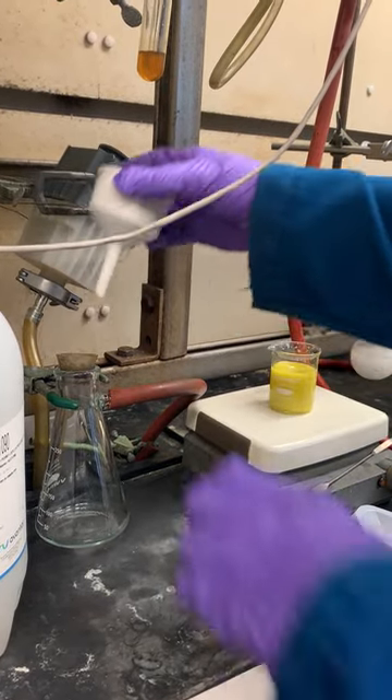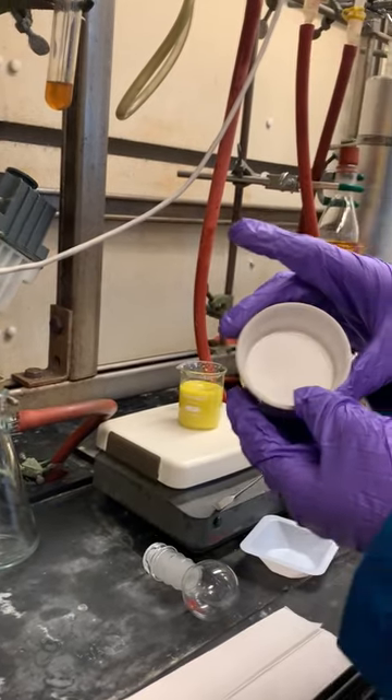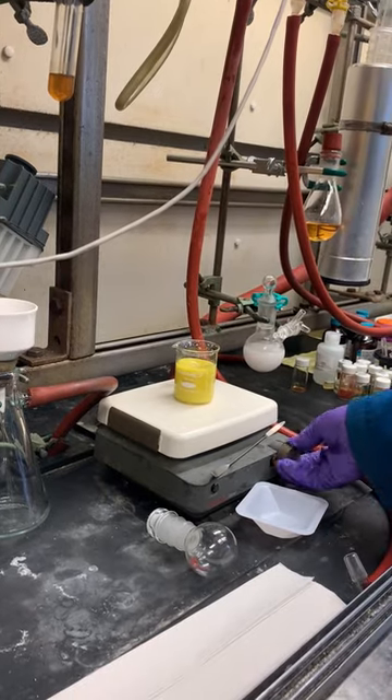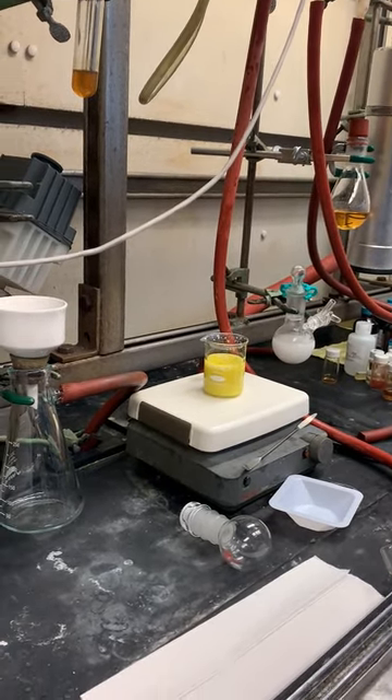I have a filter flask connected to a vacuum tube with a Buchner funnel, neoprene adapter, and a piece of filter paper. We'll stop the stirring, turn on the pump, and filter.